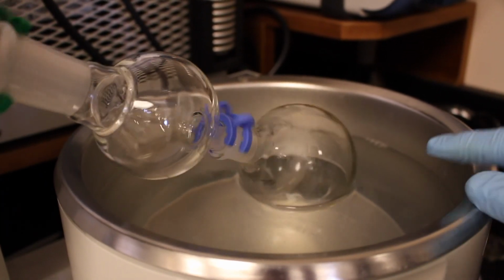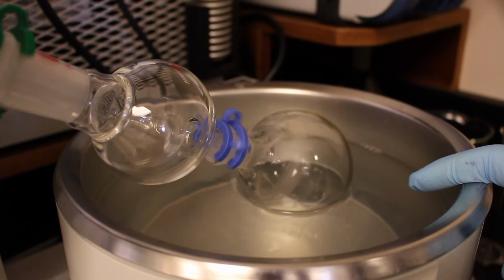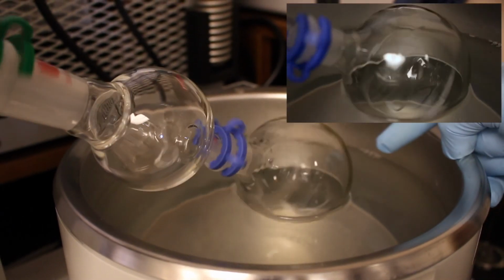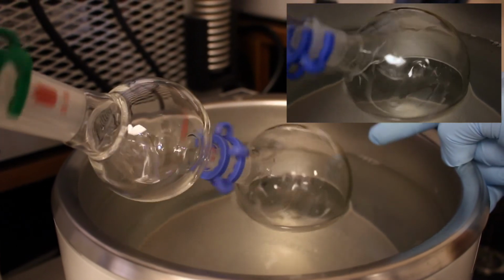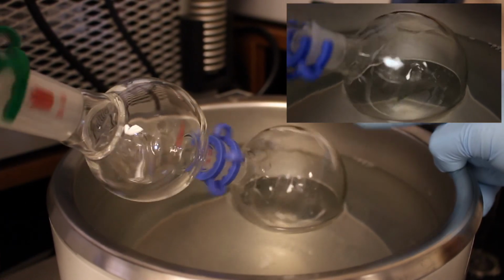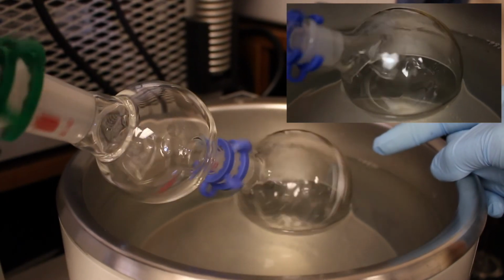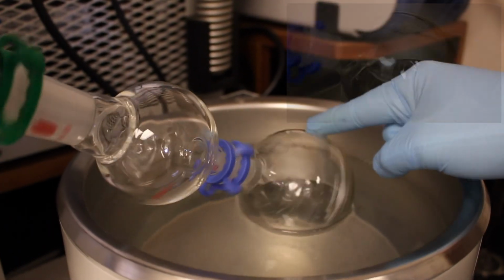So if you can see, we've removed the majority of the DCM. In the flask here is just a thin coat of what is probably the eugenol oil. So to make sure most of the DCM is gone, we'll leave the flask on the rotovap for a few more minutes, which will remove the remainder of the DCM, and then we'll have our eugenol oil left in this flask.